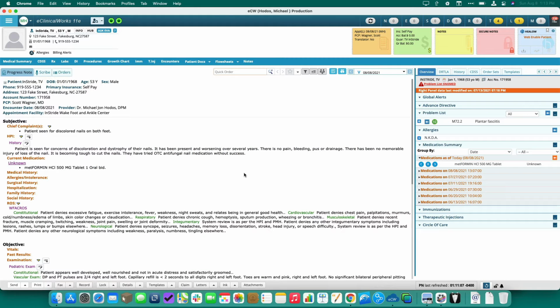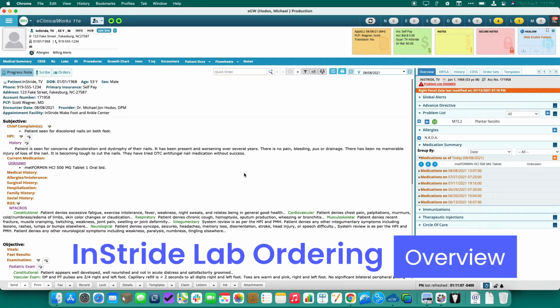Hi, in this recording, we're going to learn how to submit specimens to the InStride Lab, be that pathology, nail specimens, or cultures for PCR analysis. We're going to go over the workflow in ECW for submitting specimens.